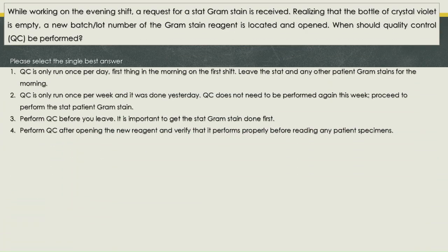While working on the evening shift, a request for a stat gram stain is received. Realizing that the bottle of crystal violet is empty, a new batch/lot number of the gram stain reagent is located and opened. When should quality control, QC, be performed? Please select the single best answer.